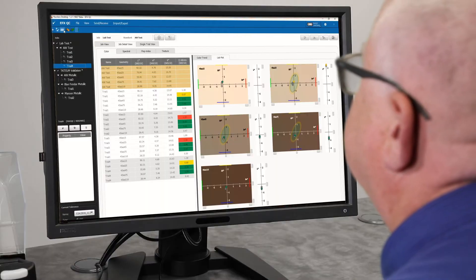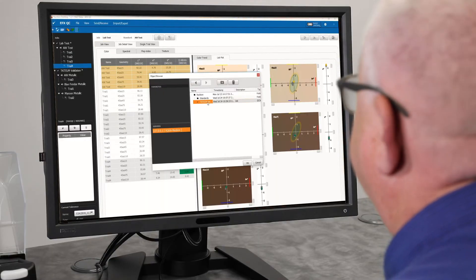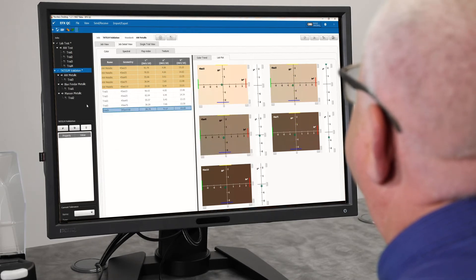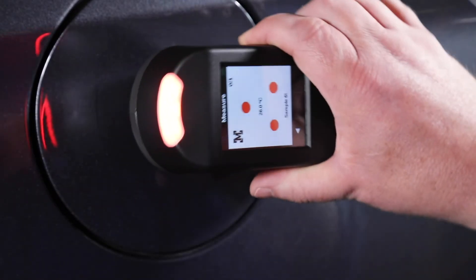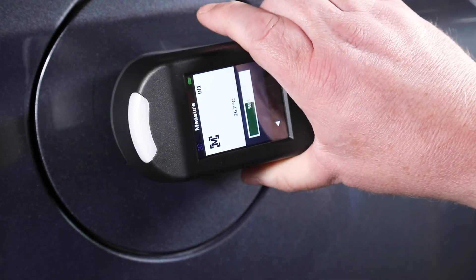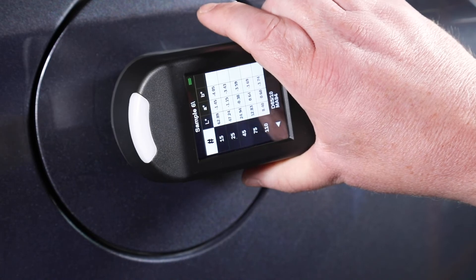And connects to X-Rite's EFX QC software to support advanced features, such as job-based searchable databases. MA5QC — enabling actionable quality control for effect finishes while maintaining legacy data for good measurement compatibility.